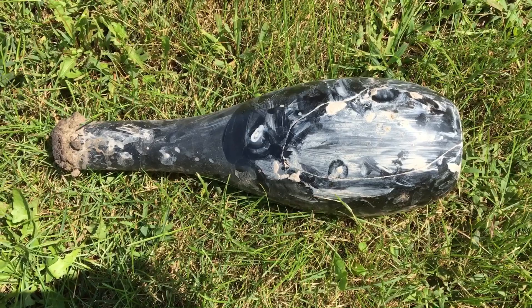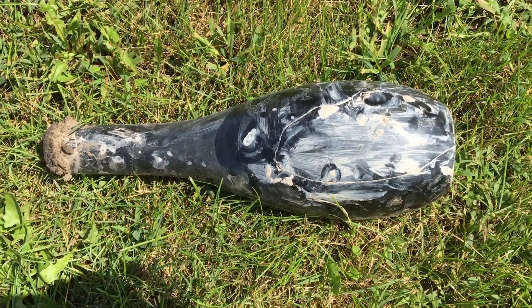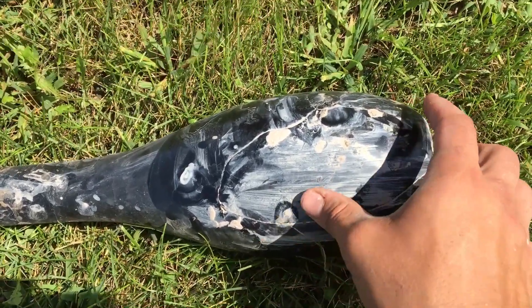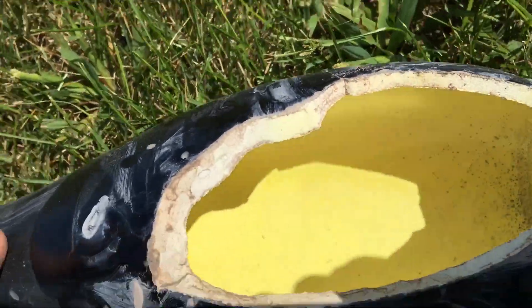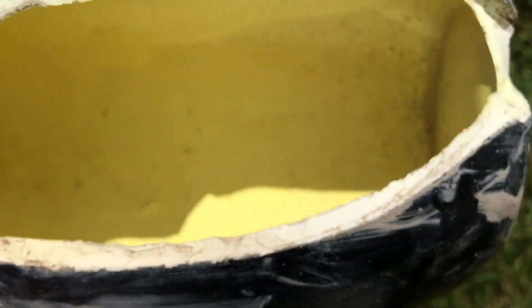I ran that weed burner with charcoal for about an hour and then I stopped seeing sulfur fumes, so let's open this up and see what we got. It's kind of hard to see, but it looks like we got something though.